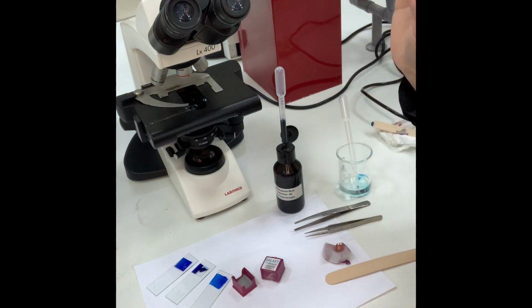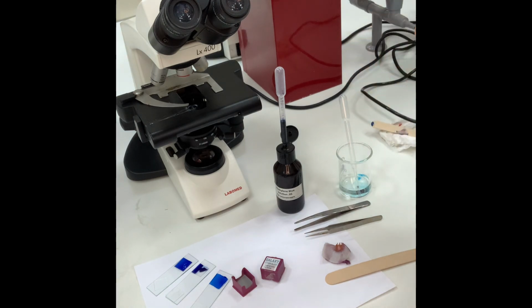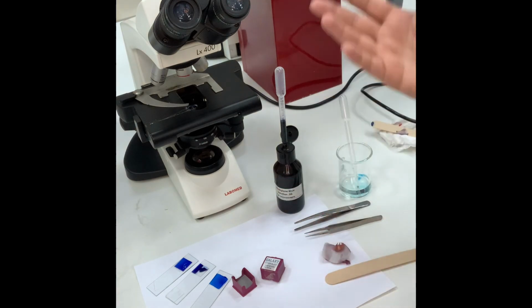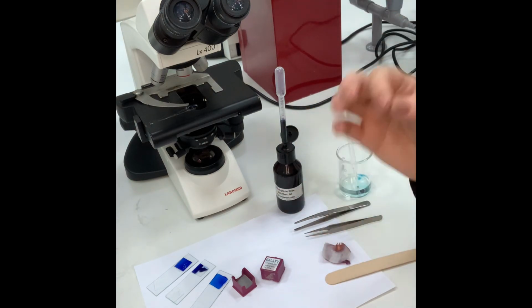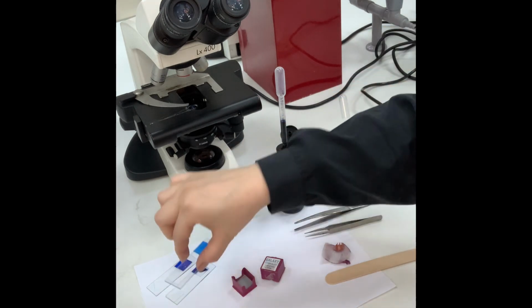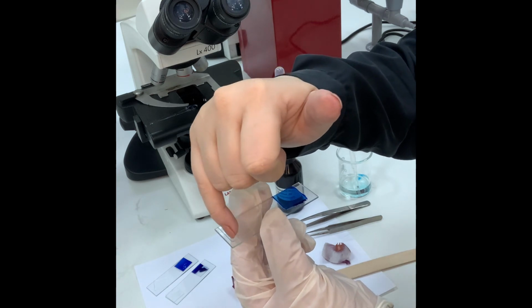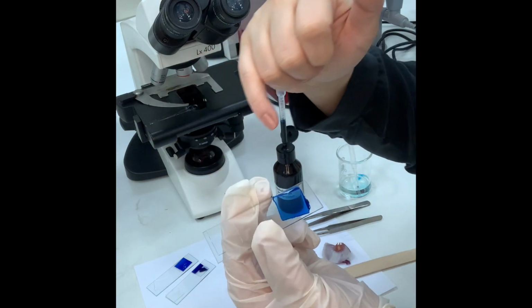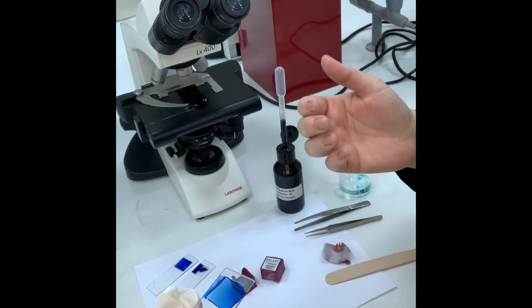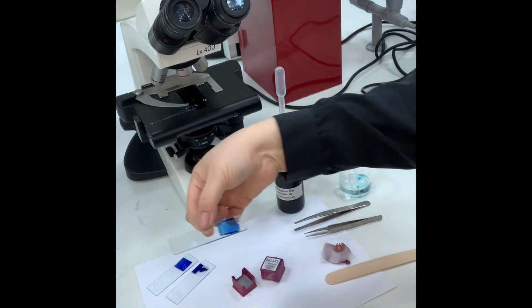Very simple wet mount slide preparation, very simple experiment. It's a slide making to view cells under the microscope, and it's a temporary slide. If I need to study that slide later on, all I have to do is add glue to adhere the cover slip on top of it, and then I will call it a permanent slide. That's it. Okay.